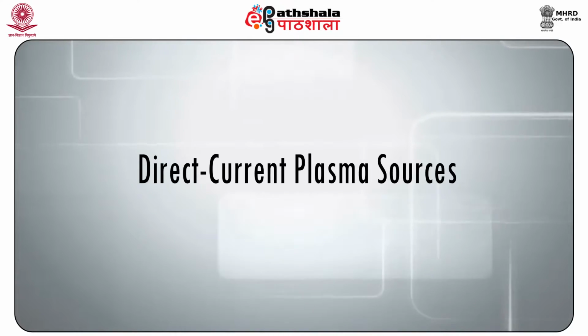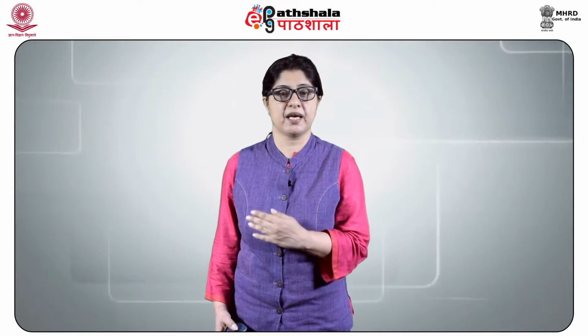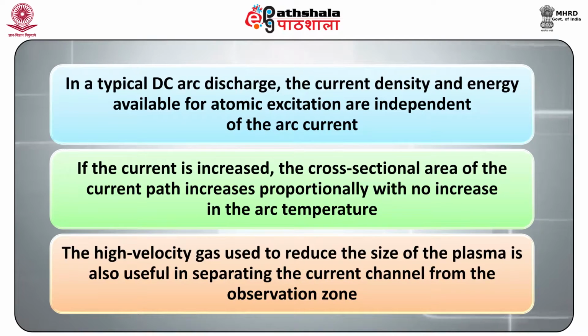Direct current plasma sources. In direct current plasma sources, a high velocity inert gas produces high temperature plasma and separates the excitation energy from the analytical observation zone. In a typical DC arc discharge, the current density and energy available for atomic excitation are independent of the arc current.